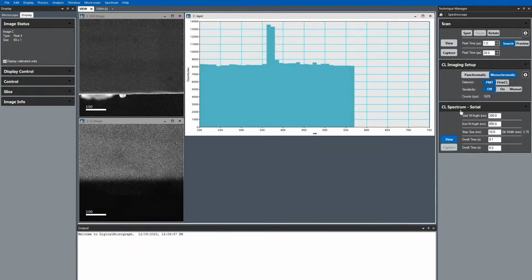It does know which diffraction grating is in there. We have two currently inside, 1200 lines per millimeter and 2400 lines per millimeter. We own one other that, if you wanted to work outside of these ranges, we would have to install for you, but it's a very quick install. It takes like 5 minutes. It is something that's a staff level install just because you open up the light box and scratches or debris can ruin your imaging.